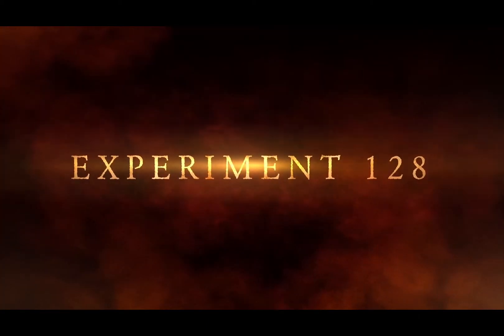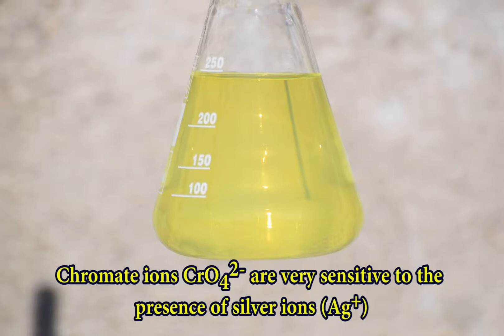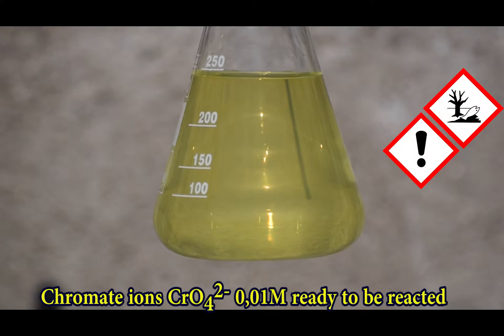Silver identification with chromate ions. Chromate ions are very sensitive to the presence of silver ions. Moreover, both react in a very specific way, which makes this reaction suitable for analytical purposes.